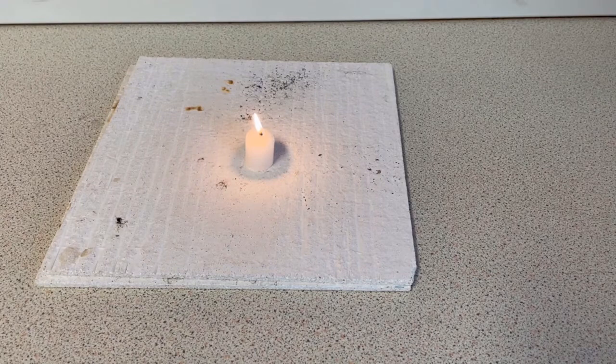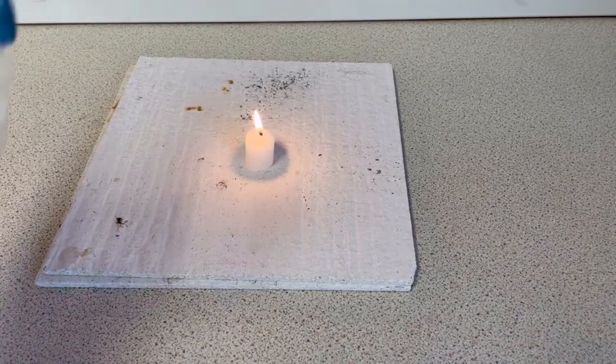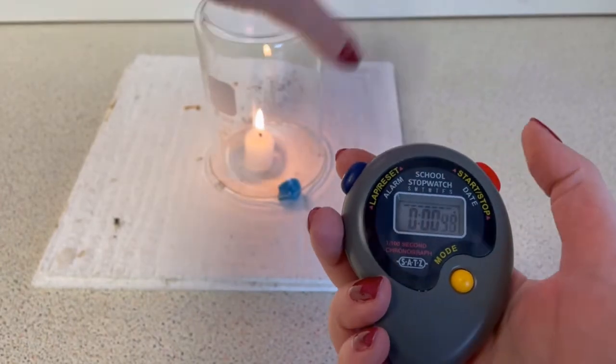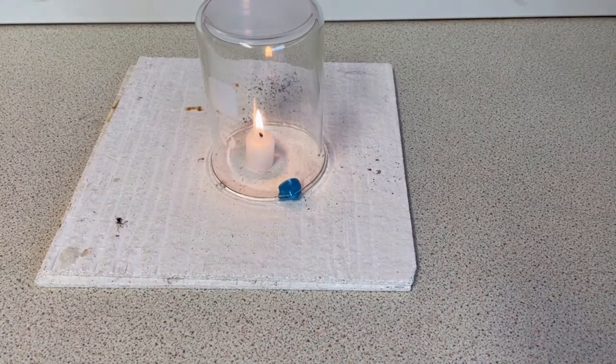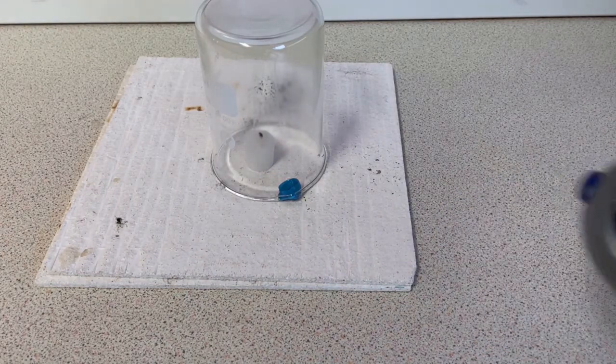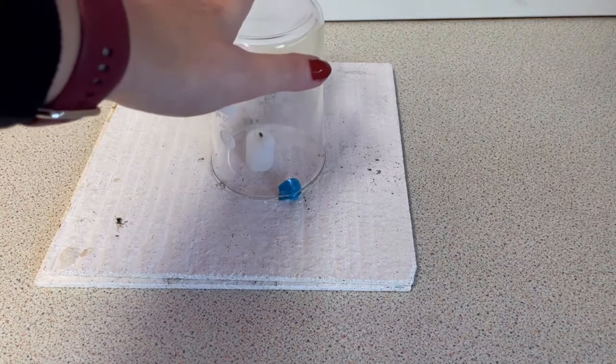So the next beaker we will use is a 400 milliliter beaker. So I'm going to place that over now, and I'm going to start my stopwatch. And that took 14.44 seconds. I'm going to repeat this 3 times so that we can calculate a mean, and I'll provide you with those results soon.